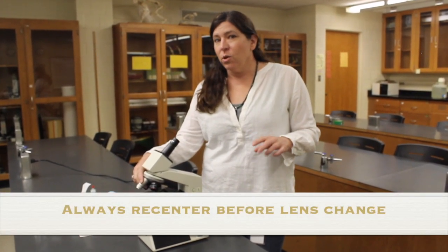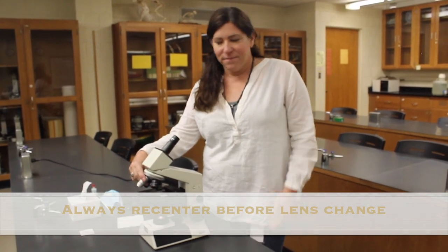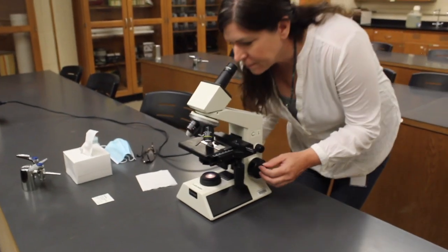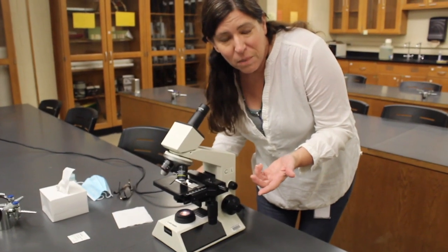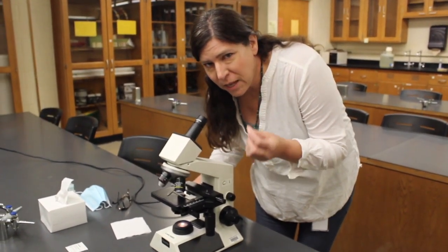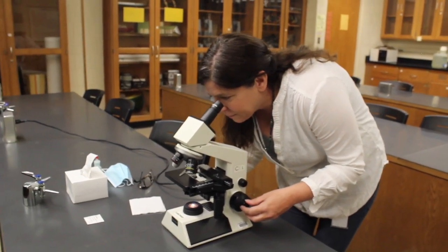We're going to take it up to high power now and see what that looks like. Remember that the letter E has to be centered in order for you to see anything on high power. High power is 40x. So we're going to click it into place and then take a look in. I'm not seeing much of anything, and that's normal because our high power is so strong. So you're going to play a little bit with the fine focus until you see something.